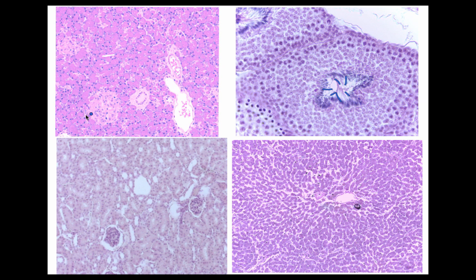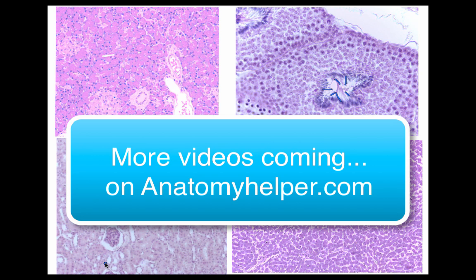When comparing the pancreas and the kidney cortex, they may look similar individually on a test — you might see a little circle of cells in each and get confused. When looking at the pancreas, the islets of Langerhans will not have any white space around them. In the kidney, the renal corpuscles all have a white capsular space where the filtrate enters. I think that brings us to the end of the video — I hope it was helpful.